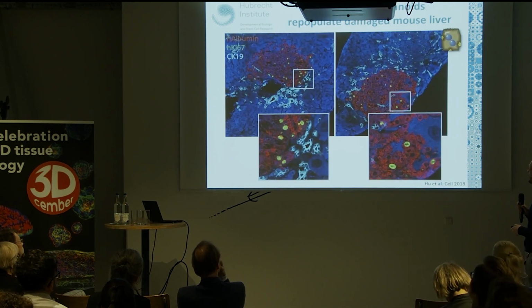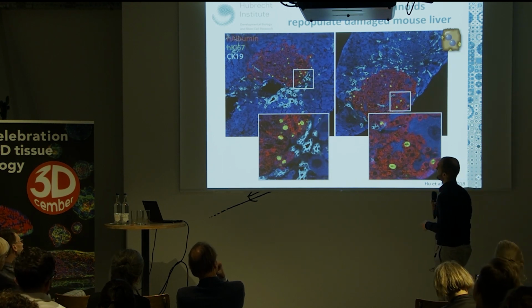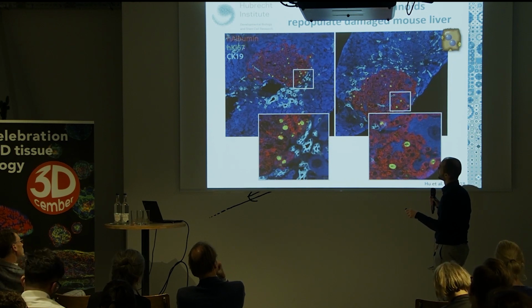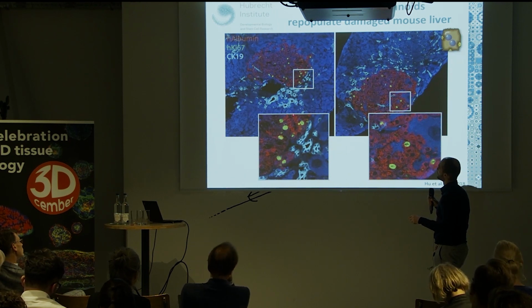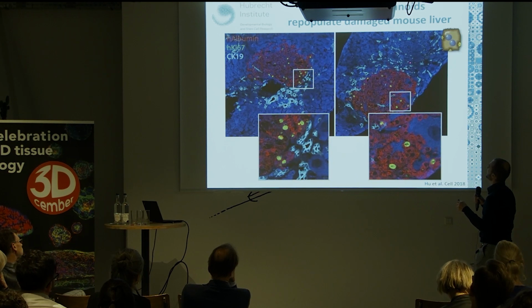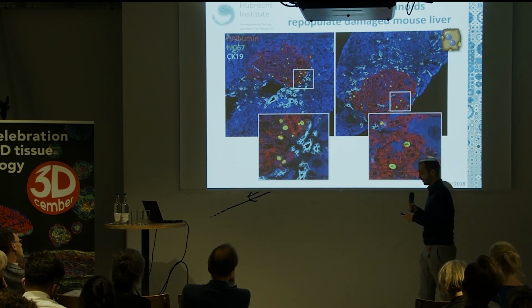So these are now the hepatocyte organoids. This is after 3 months in an immunosuppressed tyrosinemia model mouse. So this is a chronic liver damage model. And you can see here in red the human cells stained for human albumin in the mouse tissue. And you can see that even at this three-month time point, we have lots of cells that are positive for Ki67, so they are still proliferating. And I hope you can appreciate how well the human cells are integrated into the mouse liver, connected to the biliary system, connected to blood vessels, and so forth.